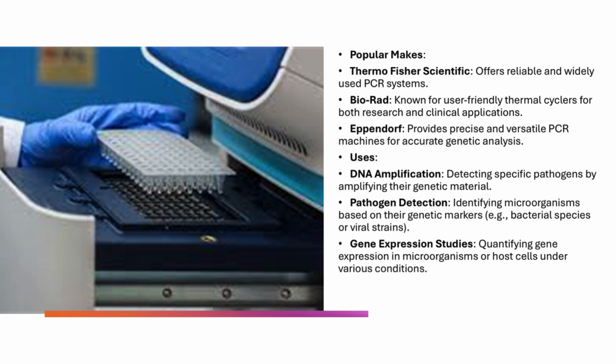In summary, the PCR machine is a game-changer in molecular biology and microbiology, enabling the amplification and detection of DNA or RNA at a molecular level. Whether you're detecting pathogens, studying gene expression, or amplifying genetic material for research, PCR is an indispensable tool in the microbiology lab.